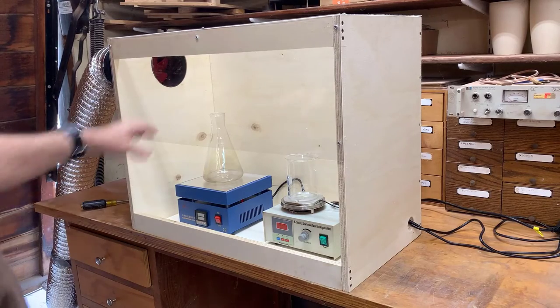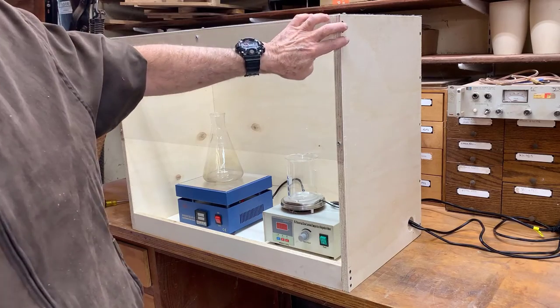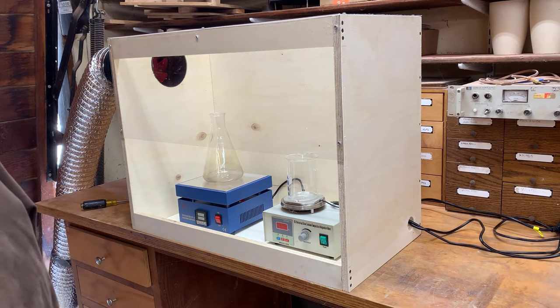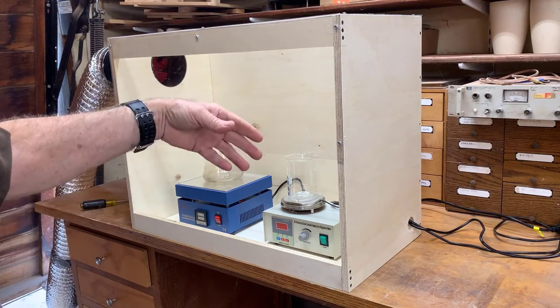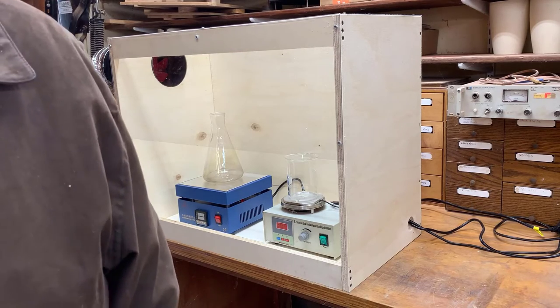The other really nice thing about it is it's really light, and it's only put together using screws. It can be broken down in roughly 10 minutes and assembled in a similar time. So when I'm not using it and I want to get rid of it for a while, I can tear it apart, put it away, and put it back together when I need it.